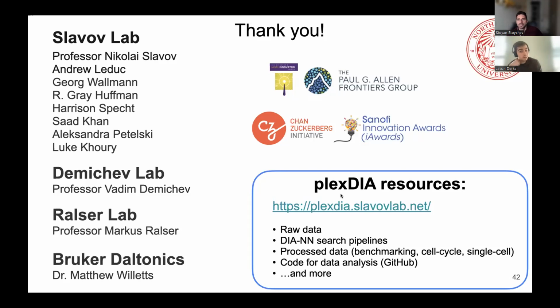Yeah, you're talking about the peak shape of the elution profile? Yeah, absolutely. You're absolutely right. And this is actually something that DIA-NN does. It takes correlations of the MS1 profiles to the most confident one, and it'll assign scores on its confidence based on how well it correlates to this best channel, and does that at the MS1 level and at the MS2 level. So yeah, this is actually something that DIA-NN does for plexDIA data.